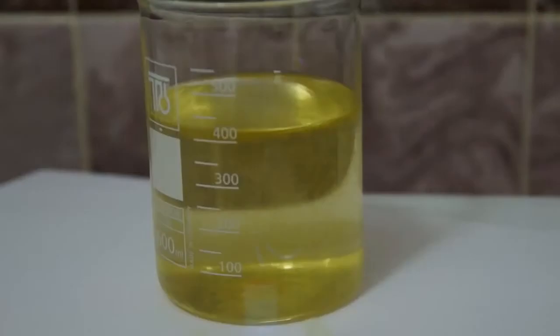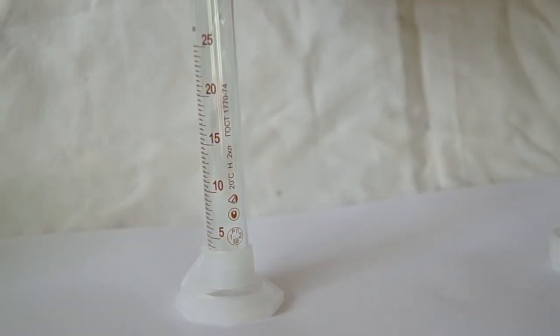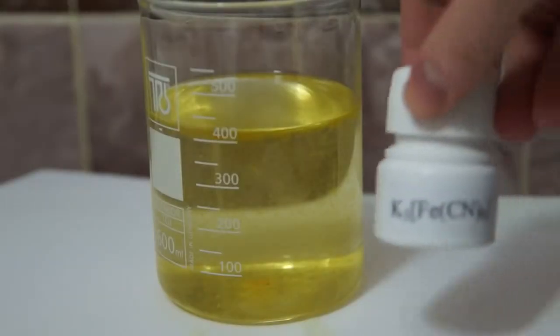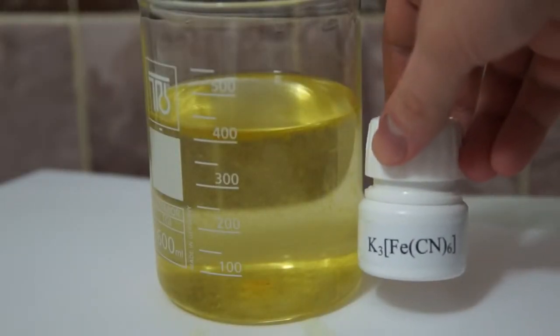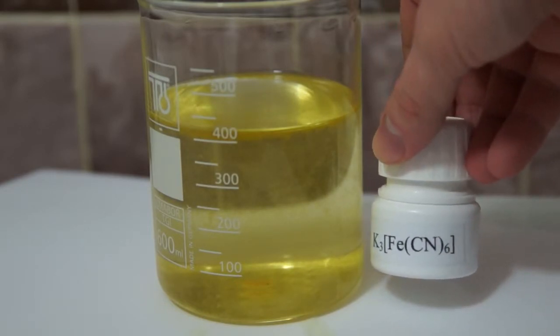There is another method of the luminescence of luminol. I took 2.3 grams of luminol and dissolved it in a 1% alkali solution. I also added about 10 milliliters of 30% hydrogen peroxide to the solution. To start the glowing reaction, I just add a catalyst — either red blood salt or potassium ferricyanide.